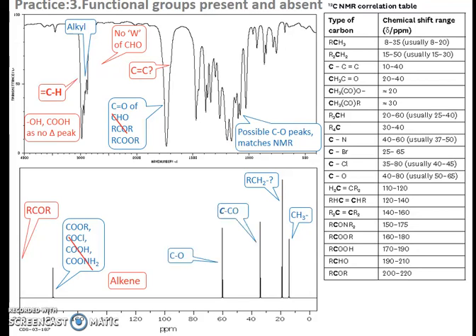So what else have we got then? We have that carbon oxygen bond and we have probably some other carbons or CH2s, CH3s. And this one, as I said, is an ester. And it has actually got a branch chain on the end of it as well.